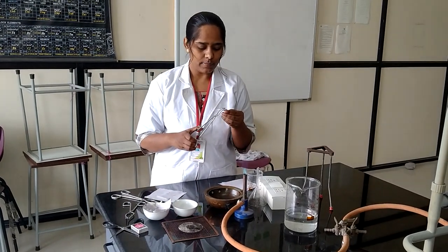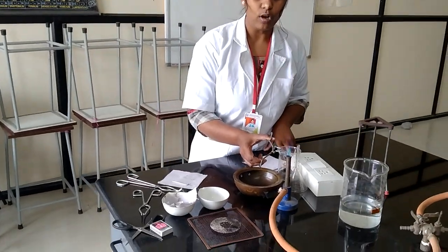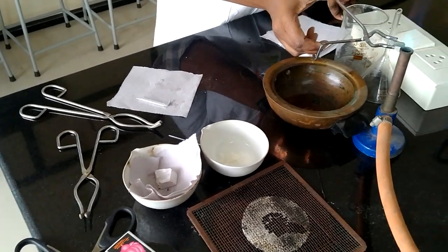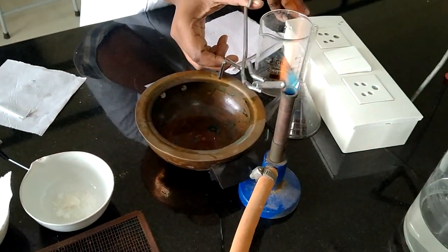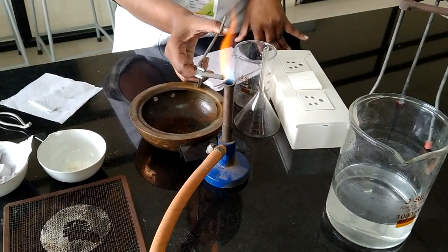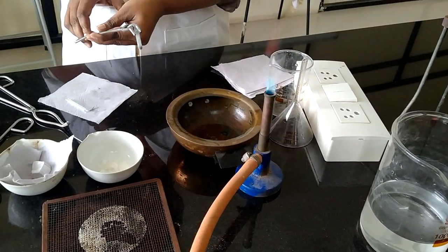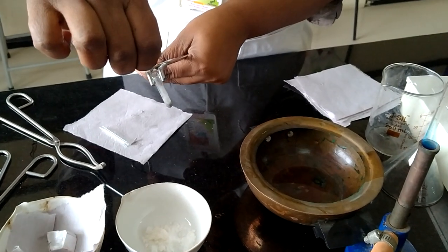Burn the sodium metal until the flame becomes red hot. After that, add a pinch of organic compound into the fusion tube.